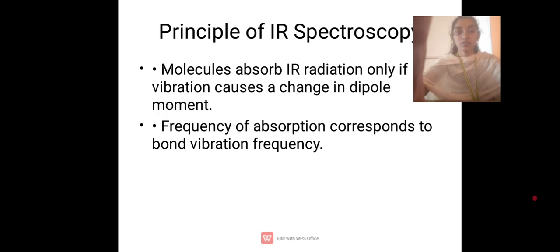Principle of IR spectroscopy. Molecules absorb IR radiation only if the vibration causes a change in dipole moment. The frequency of absorption corresponds to the bond vibration frequency.